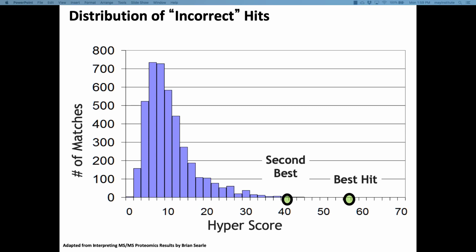Imagine you have the same sequence occurring in a database, but two amino acids are flipped. So one spectrum reads AL, the other reads LA. Then you still share most of the B ions up to this point and most of the Y ions. So there is also a degree of incorrectness when it comes to peptide identifications. Even incorrect peptide identifications can be partially right, and that means they will have higher scores than you would expect from totally incorrect scores. But we can use this score distribution to give us some confidence in that.